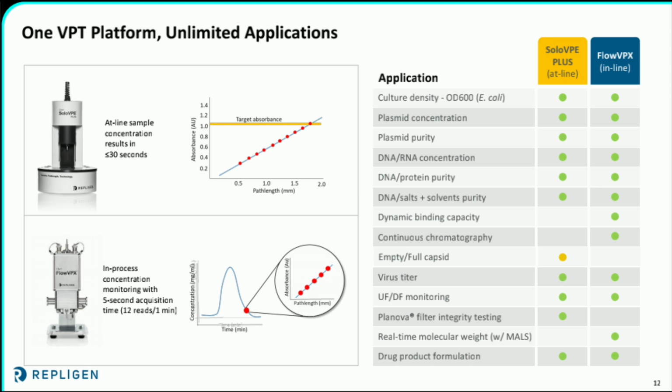So James, while everyone's answering this poll question, I did just want to talk a little bit about what's happening in the system back here. For everyone's information, we started with 25 mg per mil BSA with an extinction coefficient of 0.667. So that's the material we're using today. We're not doing any diafiltration to save time, and our goal is to concentrate up to 75 mg per mil.